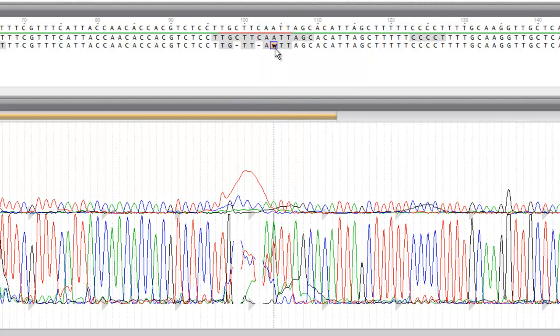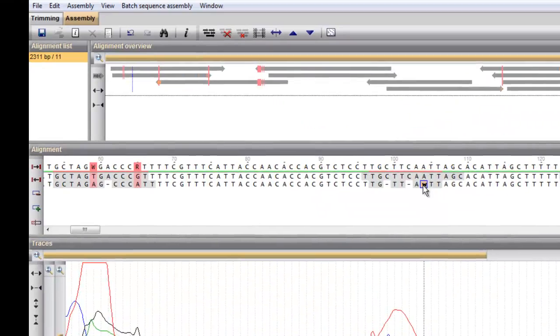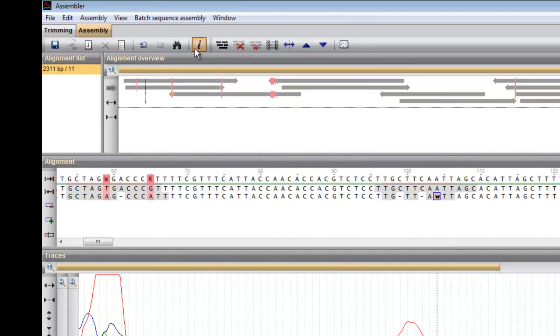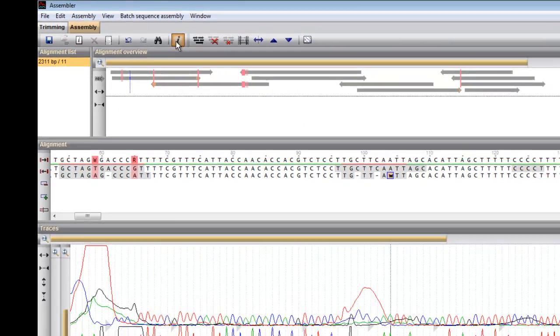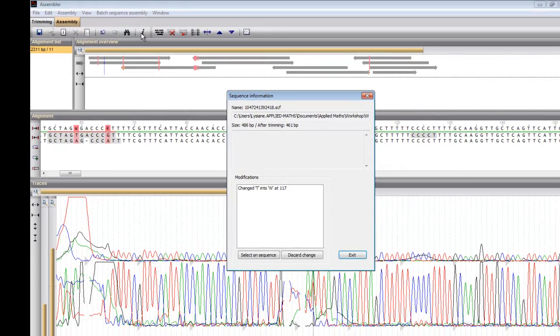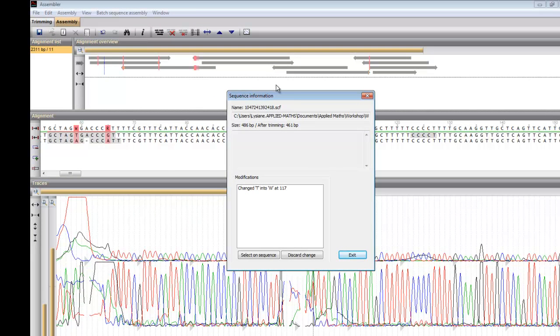All modifications made to a partial sequence are listed under the information button and can be selected and or discarded from within this dialog.